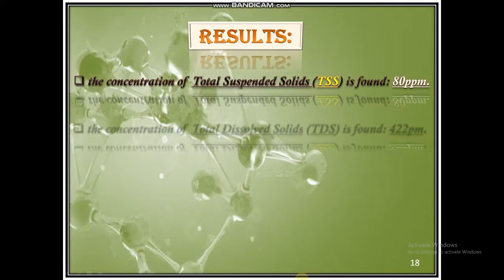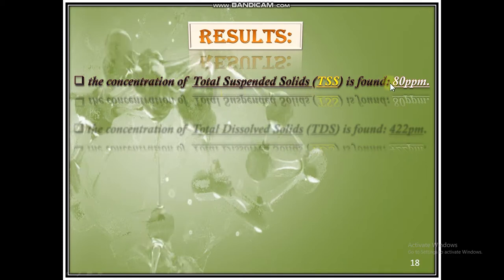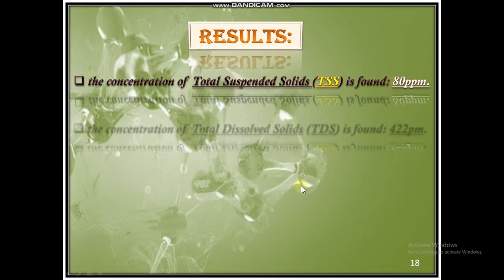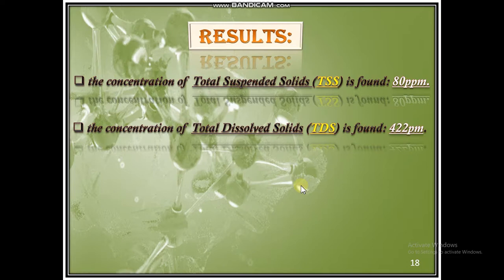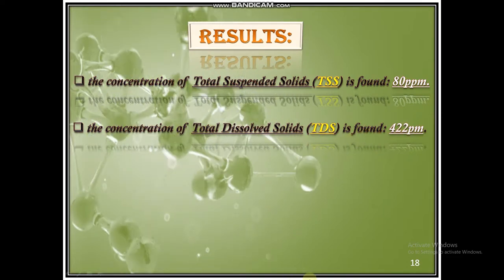Now moving towards the results. The concentration of total suspended solids found is 80 ppm, while the concentration of the total dissolved solids is found to be 422 ppm. So this was all about my presentation.